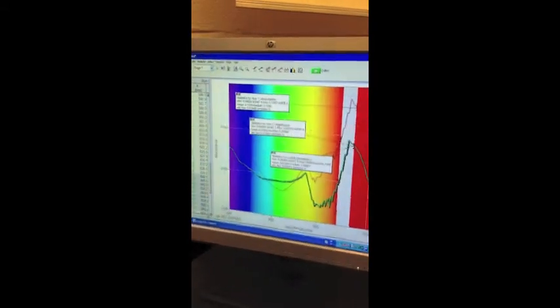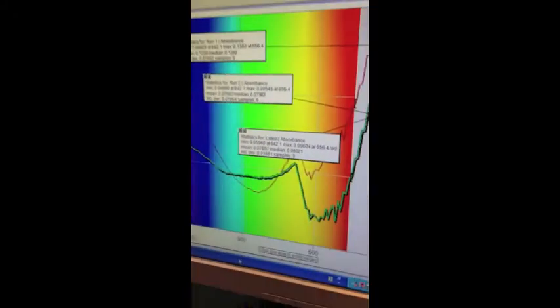So for our first run, you can see that our max absorbance occurred at 656.4 nanometers. For run 2, it was also 656.4. And our max for this one was 656.4. So you can see that the maximum absorbance was caused by a common wavelength. Isn't that interesting? Alright? So you can do a variety of lab procedures with this data. So this has just been a quick run through on how to find absorbances using different types of solutions.